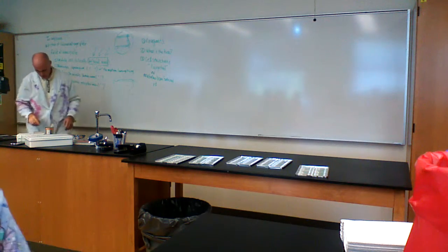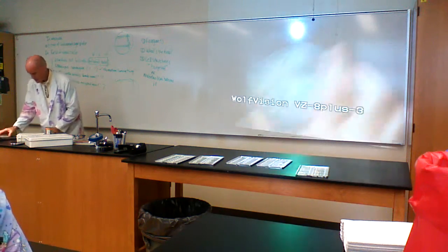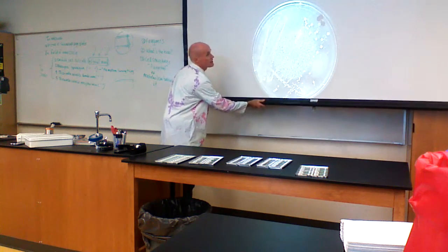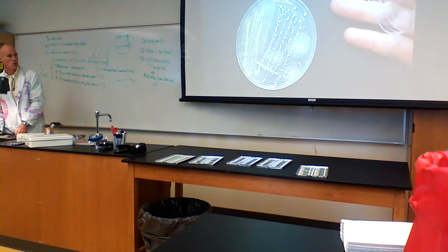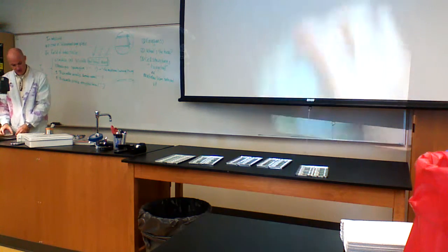I grew up something like this. How many species are on here? About 4, or more. I wouldn't expect you to judge anything that's not obvious, but this is probably 3 or 4, and that's a mess. I want to study them individually.